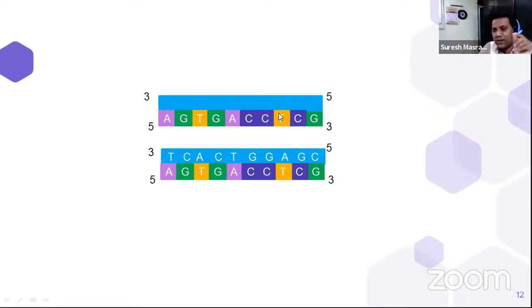Now we mark the area where the bands are present. We now know which one is the upper side and the downward side. The area which has the bands indicates the heavier DNA fragment, and the opposite pole shows the area indicating the lighter fragments.